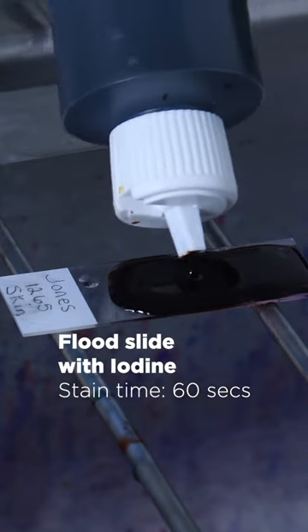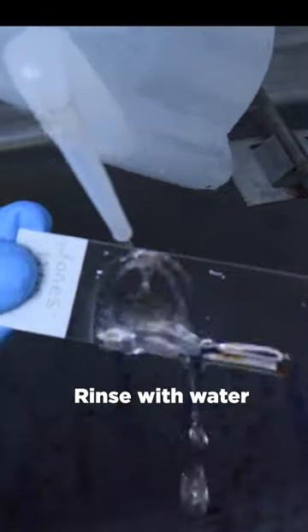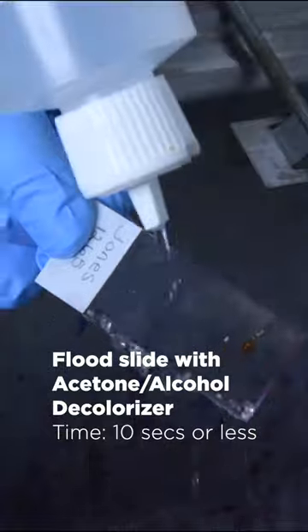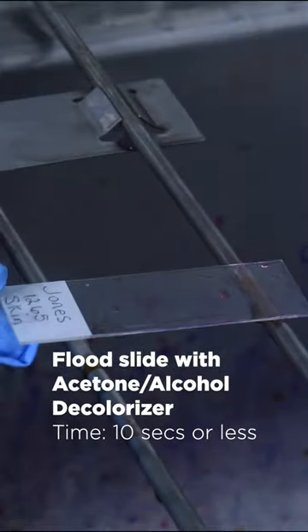Flood slide with iodine. Gently rinse the slide with water and allow to drain. Tilt the slide and flood with a few drops of decolorizer until no violet color runs off.